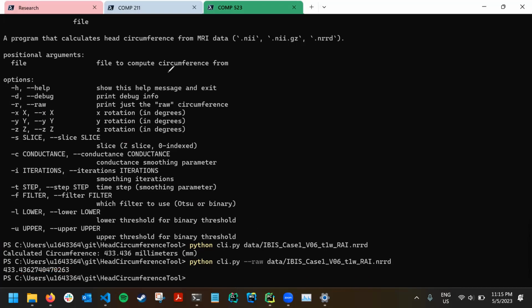It's really up to you. In Bash, I'd probably do something like this, and then you could just print each output into one big file. But yeah, it's a useful feature for scripting, I think.